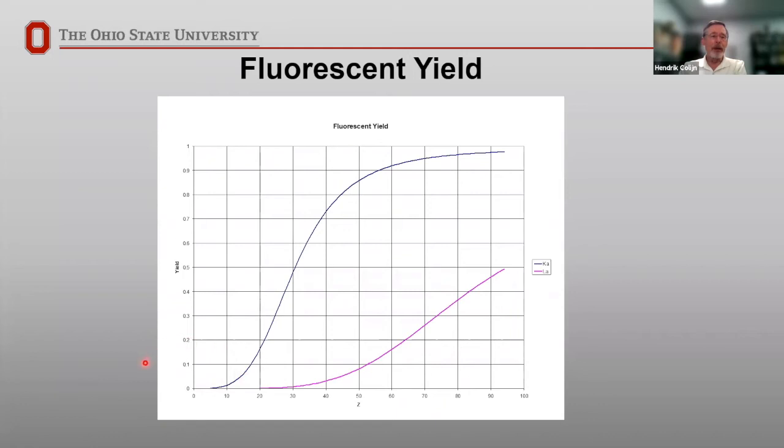So any kind of uncertainty in this fluorescent yield number will give you a huge uncertainty in your final result. What it will lead to are bias errors in your analysis. So you have to be very careful when you're quantifying for these light elements.